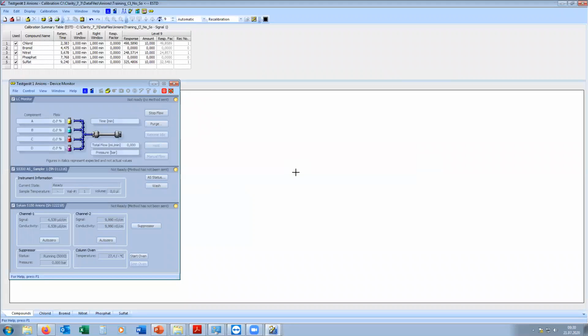Okay. So during login, there's no need for user ID or passwords. You can set them up, but here in the lab, we don't use them. You can also configure users and user rights. So you can add several users, and you can decide each user's administrative rights.